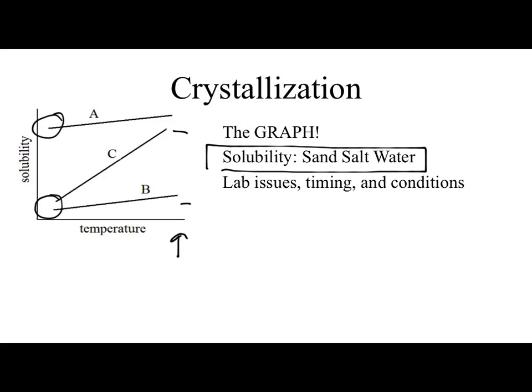I'll say you have your unknown compound with an insoluble impurity. How would you remove that insoluble impurity? Okay? That's going to require a hot filtration. So that was something to do with timing and conditions. So when do you do that filtration, which is ultimately dealing with temperature, which is your condition.